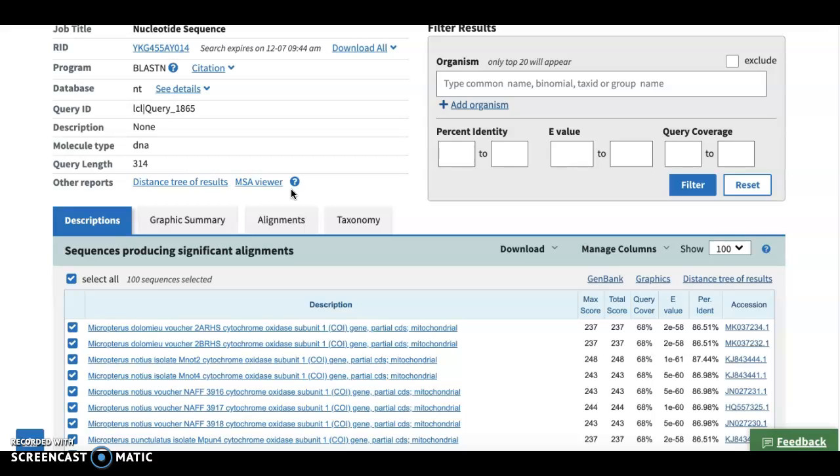Do you have data to support the hypothesis? Do you have data to reject it? So the more we sequence DNA, the more we can build this database out, and the more knowledge we can gain. All right, so pretty simple. You guys all did the steps, saw how to do it. Now you have some of the basic skills for a biotechnology program.